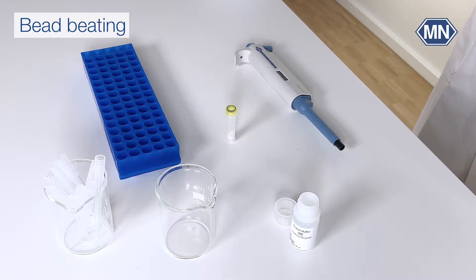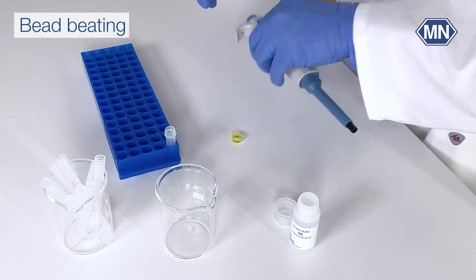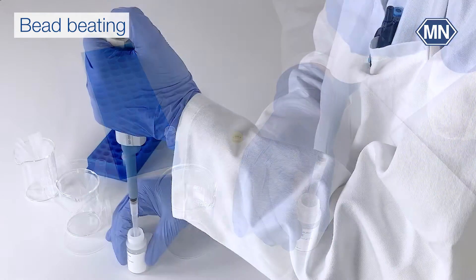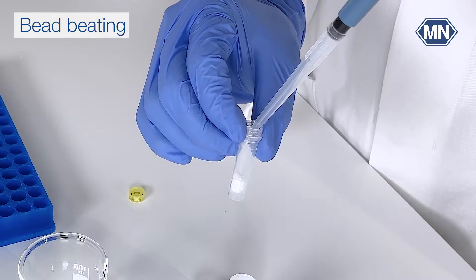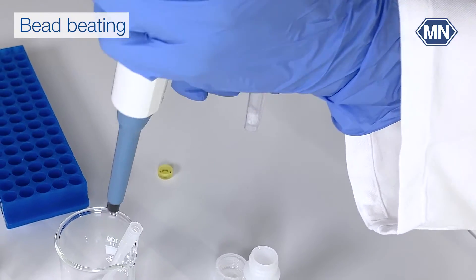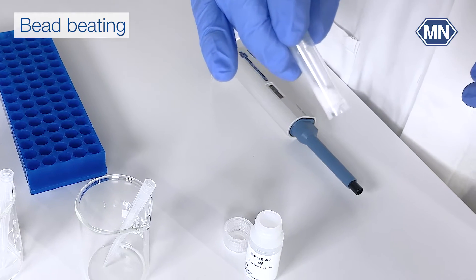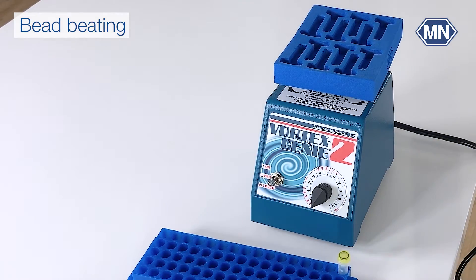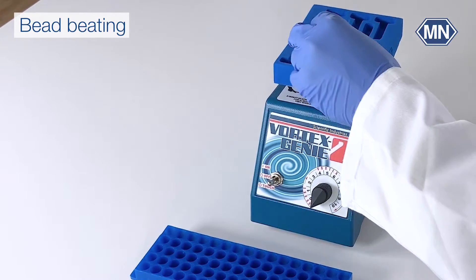I'll show the bead beating method exemplarily for yeast cells. Add some yeast and buffer to the type C bead tube. Depending on the kit and application, this buffer can be added directly to the bead beating process. Close the bead tube and insert it into the bead tube holder. Give the bead tubes a good shake to mechanically break down the cells in your sample. The optimal shaking time and intensity are determined by your specific sample type and the bead beater in use — detailed guidelines are available in our instruction manuals.